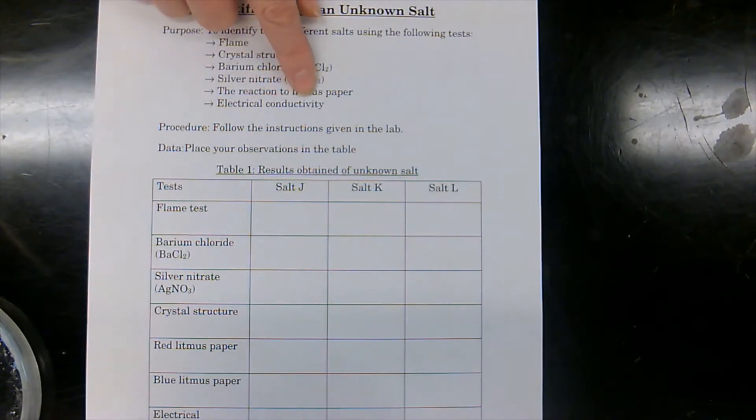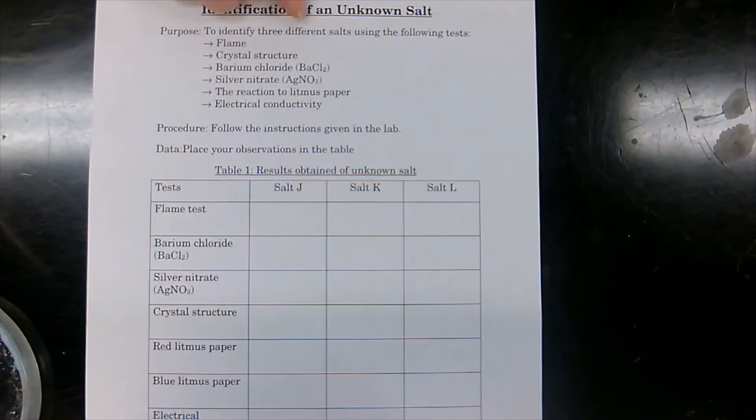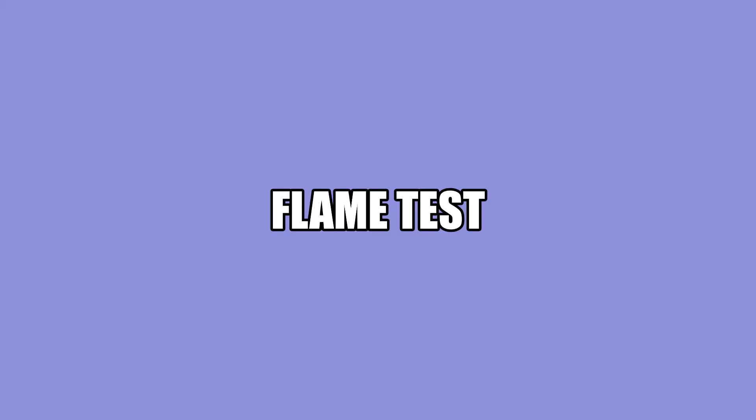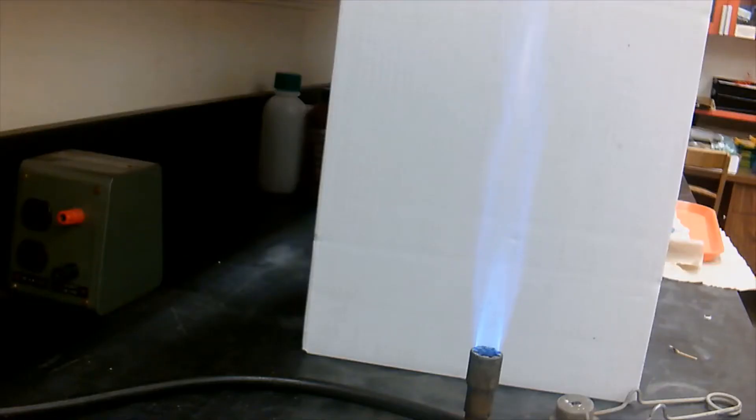And the last one we're going to do is electrical conductivity, just to see if our salts actually conduct electricity, if they are electrolytes. All right, so let's start. Now we're going to start testing our salts. So let's start by testing our salt J.